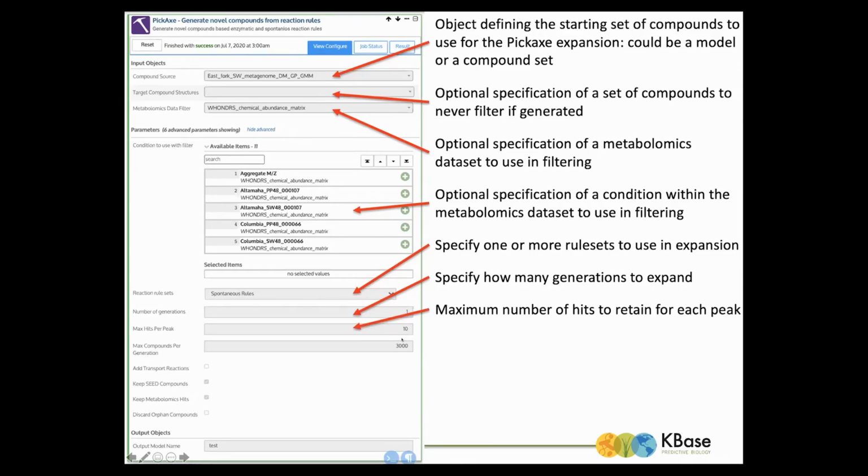So here's the thing. Once you hit a peak with a compound, it's going to do formula matching for the FTICR data. It is hypothetically capable, although this isn't tested, so if it doesn't work well, don't come after me yet, of handling cheminformatics data that's annotated with InChI strings or SMILES as well, not just formula.